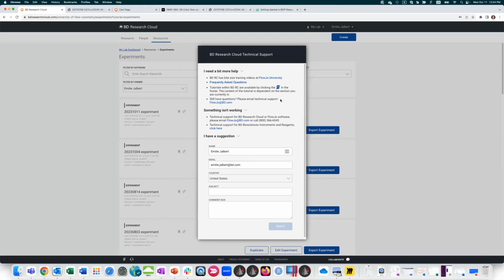We're going to be able to scan some reagents using your phone. We have some staining sheets on how you can pull in titration information from your reagents to come up with staining protocols with titers. So make sure you check back in for that. If you want to see additional features that aren't there yet, just pop it into the comment box and I'll be getting those.